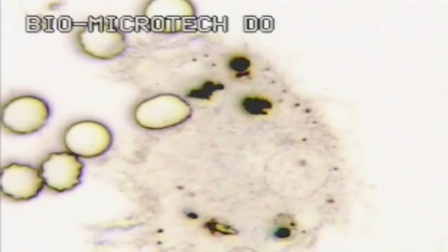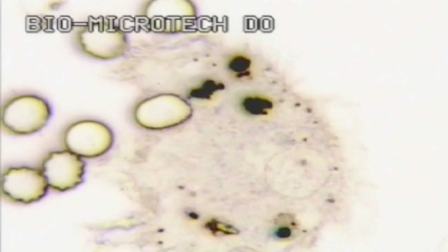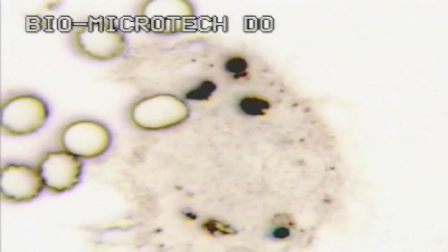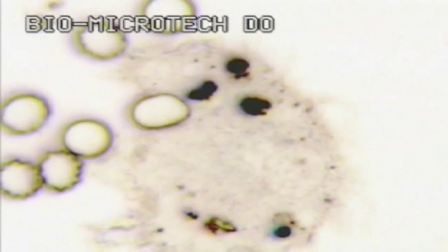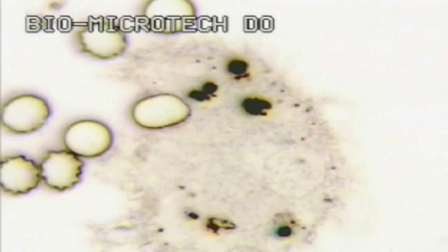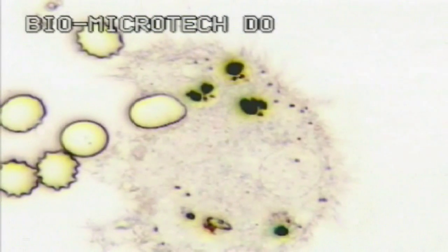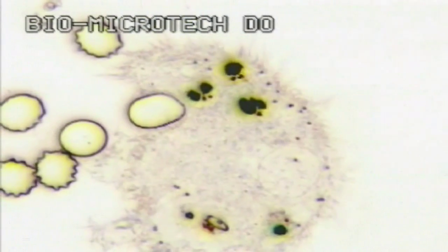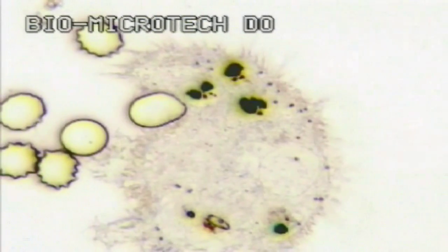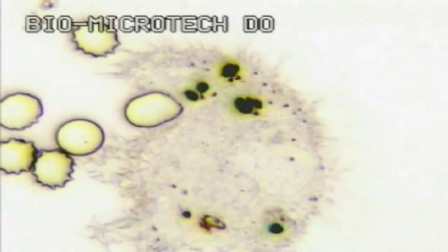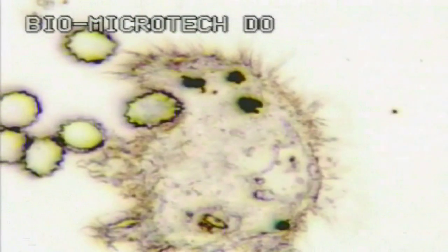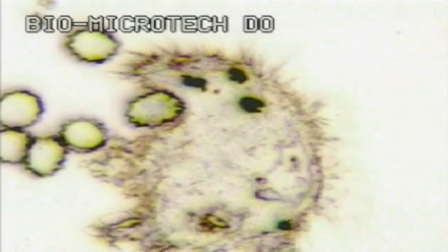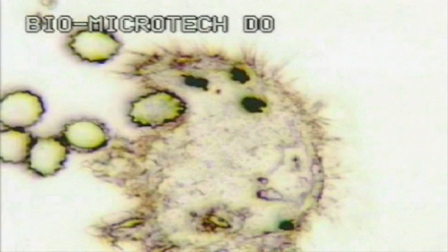This large monocyte cell is trying to engulf and destroy red corpuscles infected with malaria parasites. They look like cucumber slices on the right. This is a disease transmitted by a mosquito. Parasites enter red blood cells and can break them up. Look what happens when this monocyte dies.